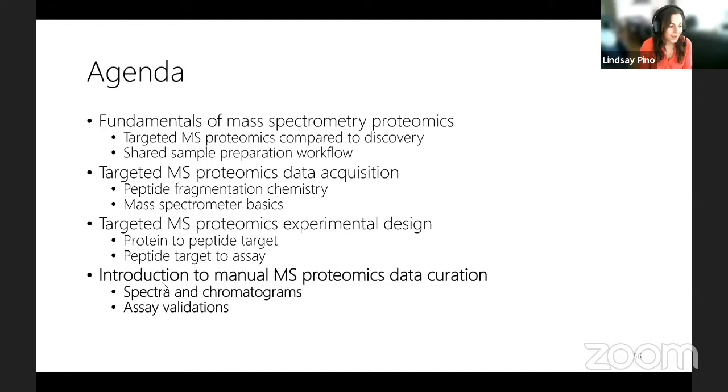How many proteins could be quantified at the same time during MRM analysis? So if you're using a triple quadrupole, how many proteins could you measure in a single experiment? It totally depends. You can really push. For example, in a PRM experiment, if you're really pushing, you can measure maybe hundreds of precursors. And if you assume 2 precursors per protein, maybe you could do like 100 proteins in a single experiment. If you want to measure hundreds of proteins, I think most mass spectrometrists would tell you to consider moving to shotgun, either DDA or DIA experiments.